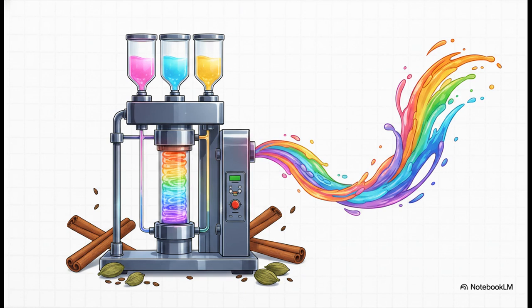But wait, what about the heavier terpenoids that just don't vaporize easily? Well, for those, scientists use high-performance liquid chromatography, or HPLC. Instead of turning it into a gas, HPLC pushes liquid-solvent mixtures through a densely packed column. By carefully tuning what they call ternary linear gradients, which is really just flawlessly blending 3 different solvents over time, scientists can simultaneously map up to 22 complex components in heavier oils like cinnamon, caraway, and cardamom. It's a brilliant chemical workaround to get that exact same level of precise mapping.